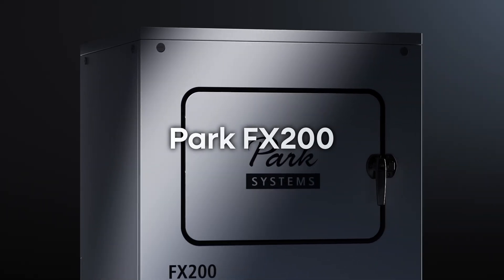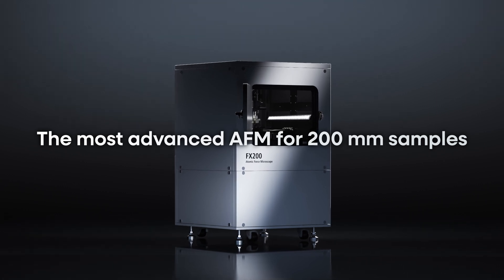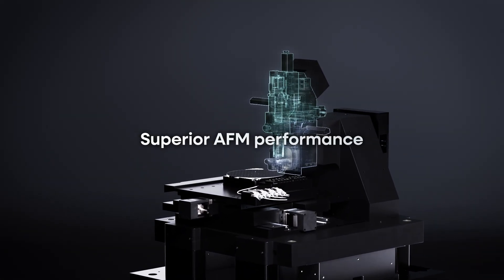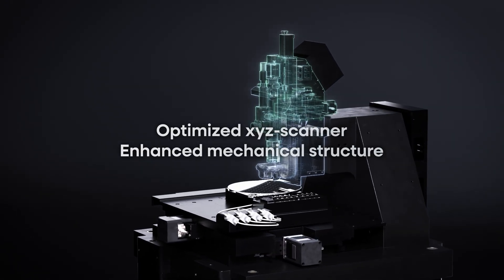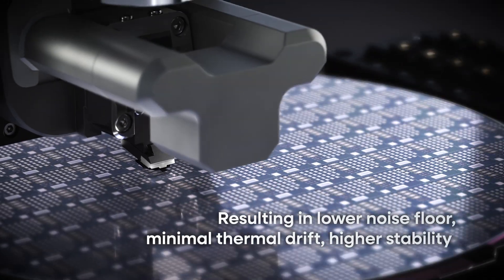Introducing the PARC FX200, the most advanced AFM for large samples, up to 200mm samples. Experience superior AFM performance with an optimized mechanical structure, ensuring minimal thermal drift and greater stability with immunity to floor vibrations.